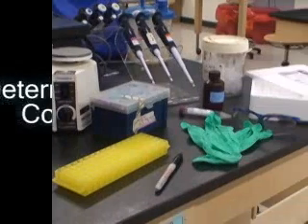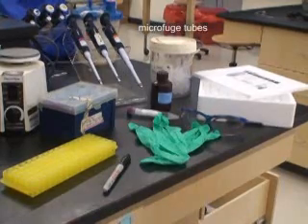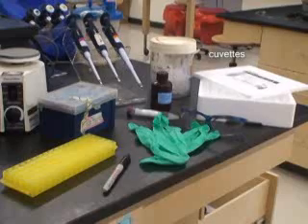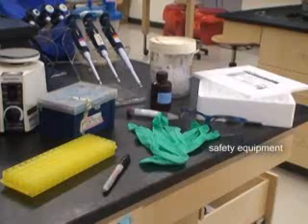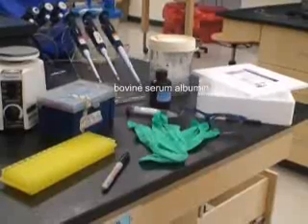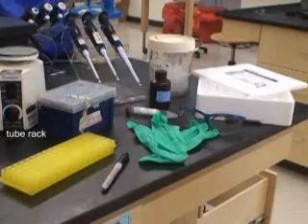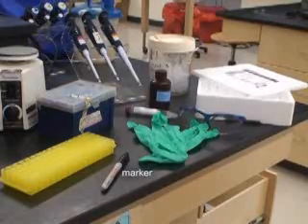Determining protein concentration. For this lab, you will need microfuge tubes, cuvettes, safety equipment, Coomassie Plus, bovine serum albumin, pipette and pipette tips, a vortex, a tube rack, and a marker.